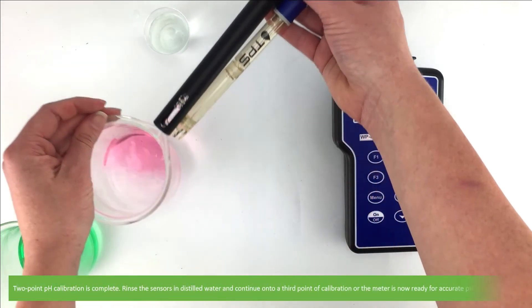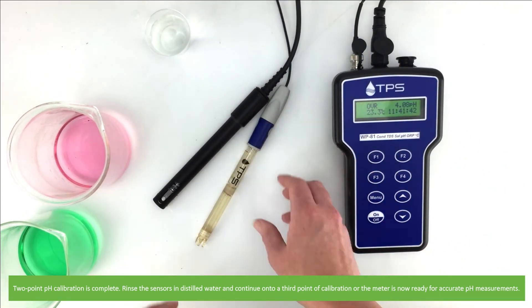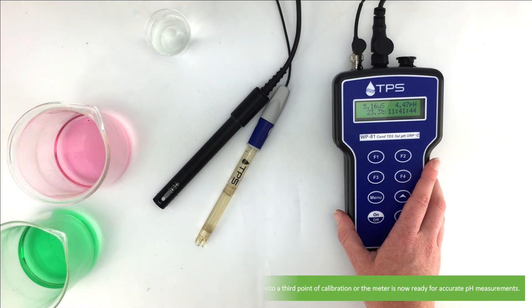Two-point calibration is complete. You can rinse the sensors with distilled water and continue on to a third point of calibration, or the meter is now ready to take accurate pH measurements.